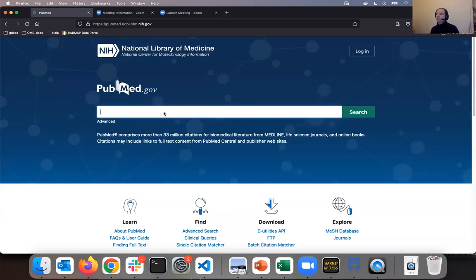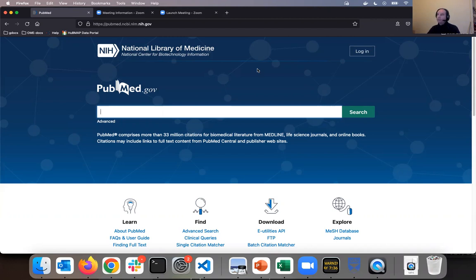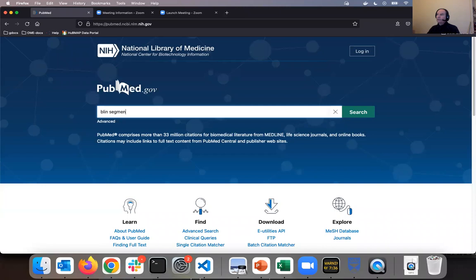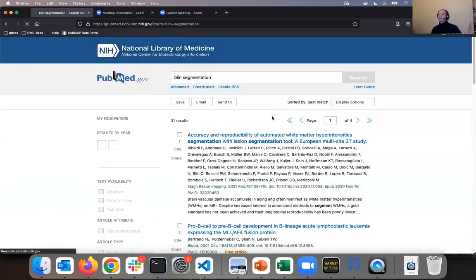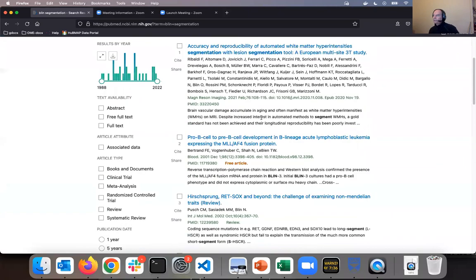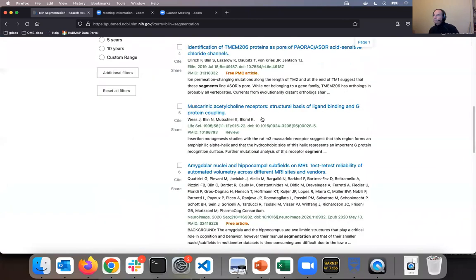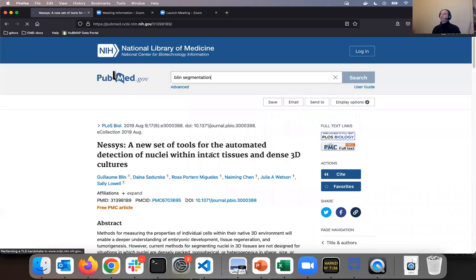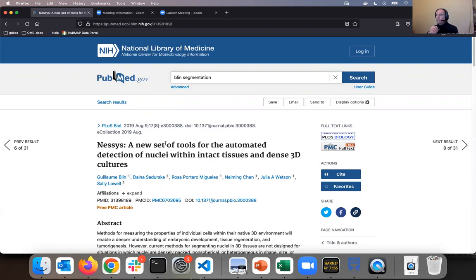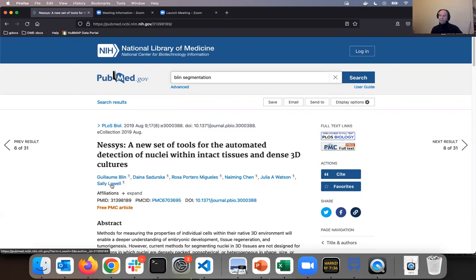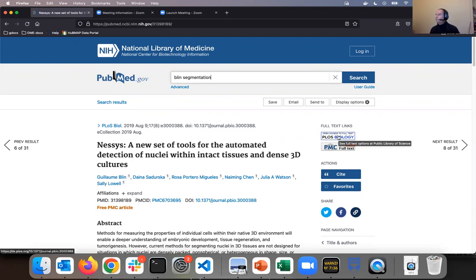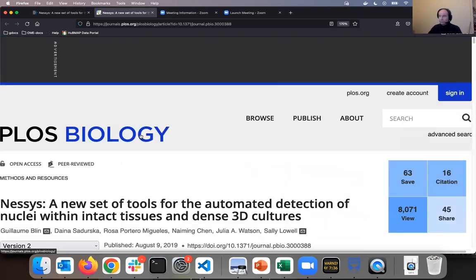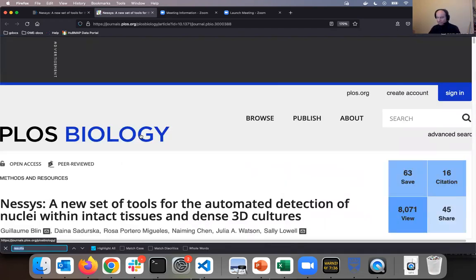I will show you the connection between the publications and IDR. I'm in the search engine of PubMed, and I'm looking for a publication about which I know that its data are stored in IDR. First author is Blin, and I know that it deals with segmentation. I'm finding it right here. It introduces a tool called Nessys, basically a tool for automated detection of nuclei within some models, among which are mouse blastocysts. It is coming from Sally Lowell's lab in the University of Edinburgh. I need the full text of this paper, which is freely available in PLOS Biology.